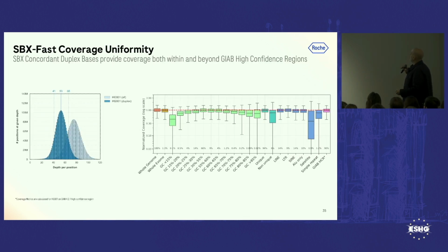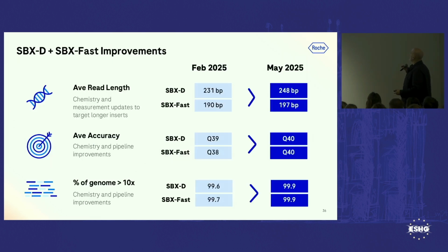Histogram, very similar to what we showed before. Same thing with read depth and coverage. Very, very good there. Continuing to work on that as well. But I think so far, very, very good coverage across the GC spectrum. Opportunities always, though, to improve.